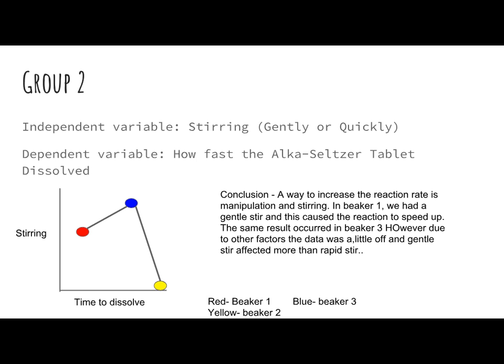Right, remember we have controls and experiments to help us maintain data comparison. So different people stirring it slightly differently, maybe the broken up pieces are not the same. We'll eventually talk about surface area, so that would be something to build on. So we should see increased agitation should do what to rate? Increased rate of reaction. We should see increased agitation, increased rate of reaction.